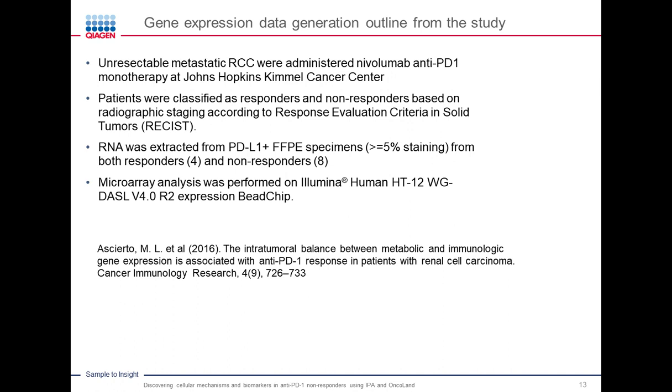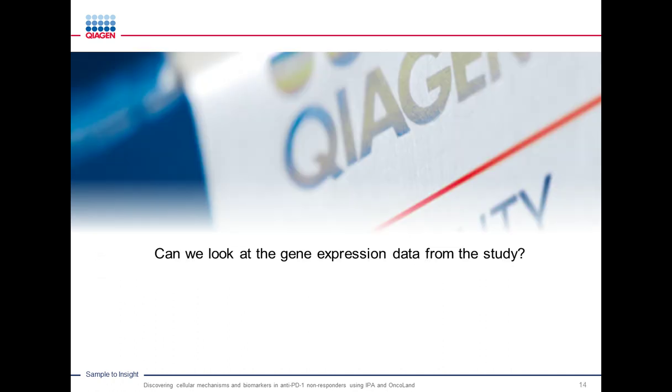What I have over here is just summary of methods. If you want to read about this in more details, you can, of course, follow the citation at the bottom and read about this in a lot more detail.